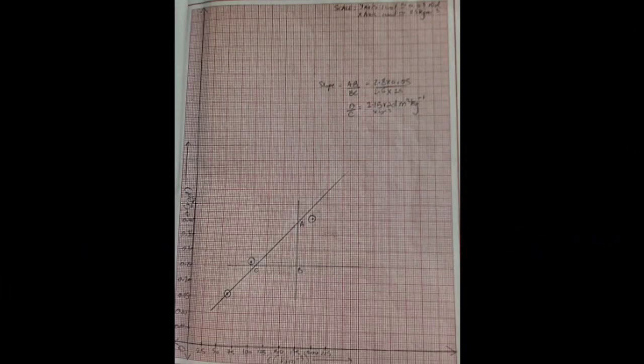The graph that we're going to plot will have the concentration on the x-axis in kg per meter cube, and on the y-axis it's going to have the angle in radians. So that's the readings that we took. When you plot the graph, you're going to get a straight line graph, and when you find its slope, the slope is going to be substituted into the formula slope is equal to theta by C, which is what you're going to write down, and then the formula used will be specific rotation is equal to slope divided by L. It's the same formula that we used in the theory calculation, except theta by C is given by slope. So you directly substitute the slope.